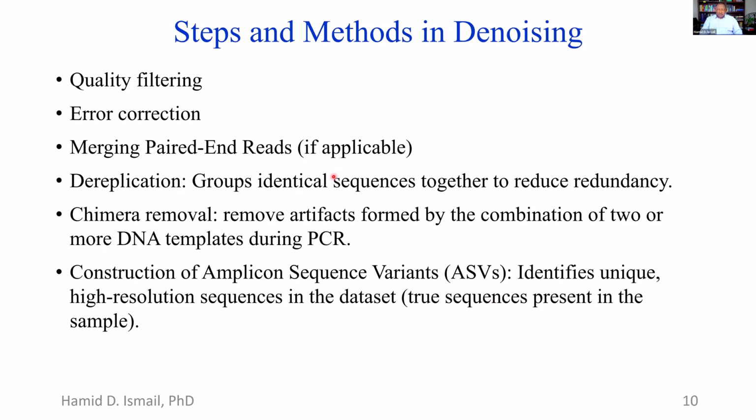So the steps for denoising, I want you to really focus on this. Usually I would give you this over maybe 2 weeks, and after that we do the pipeline step by step to show you how we do that.